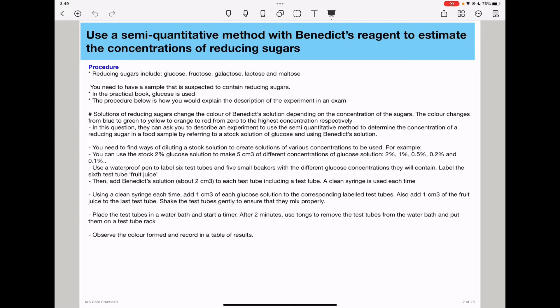You will add 2 cm³ of Benedict's solution to each of the test tubes, including the sixth test tube. For the Benedict's solution you don't have to use a clean syringe each time, but for the glucose you need to use a clean syringe every time so that the concentration is maintained as required. Then, using a clean syringe each time, add 1 cm³ of each glucose solution to the corresponding labelled test tube. You also need to add 1 cm³ of fruit juice into the sixth test tube. Then shake gently to ensure they are fully mixed.